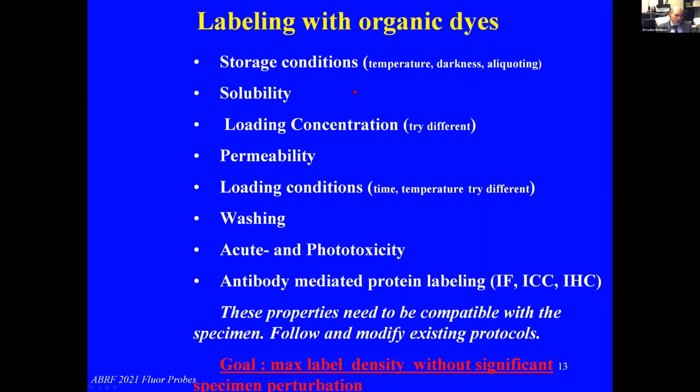And what other labs may lend you may also not be good enough. We need to pay attention to solubility, loading concentration, permeability, loading conditions, washing the dye, and its acute and phototoxicity.